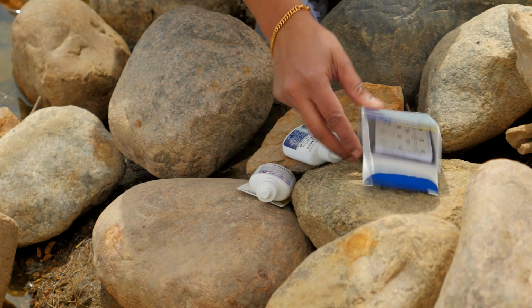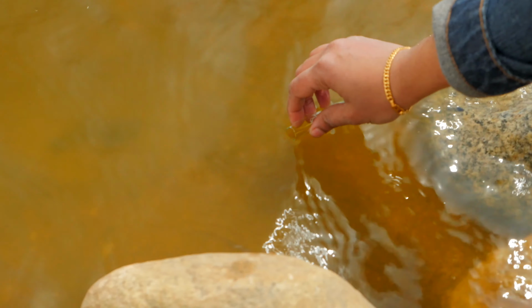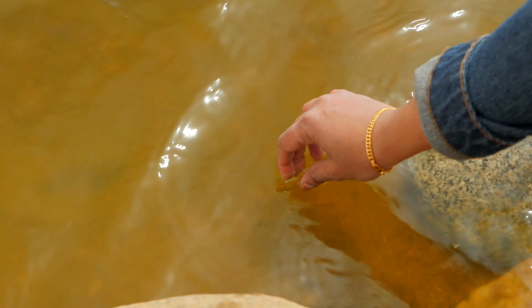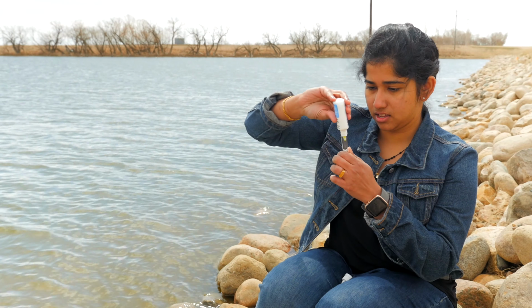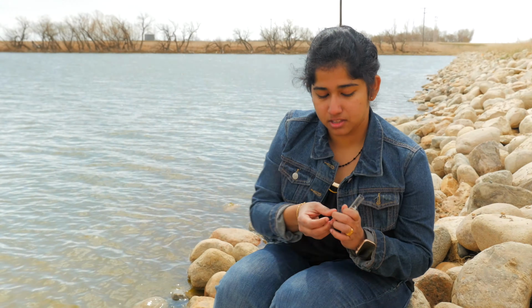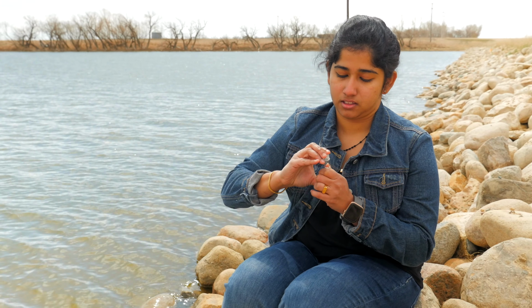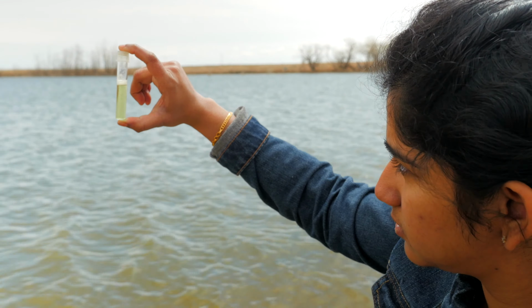To measure phosphate, you will need to collect a water sample using the vial provided in the phosphate test kit. After mixing in 6 drops from each of the 2 reagents found in the kit, take an image with the Nutrient app of the vial atop the reference card provided in the test kit.